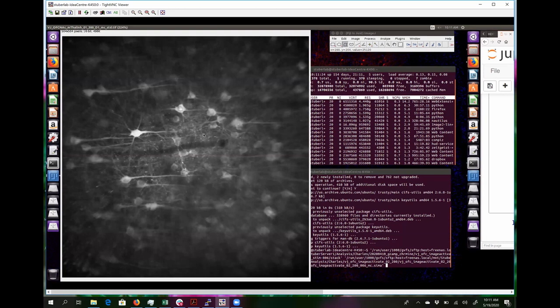It's not necessarily that the brain moves per se, but that the lens in some mice is not held as tightly as in other mice maybe. And so sometimes you see these slight movements of the field of view. My guess is it's the lens, but who knows? It's possible that it's the brain moving around a little. You just have to take that into mind and be careful.